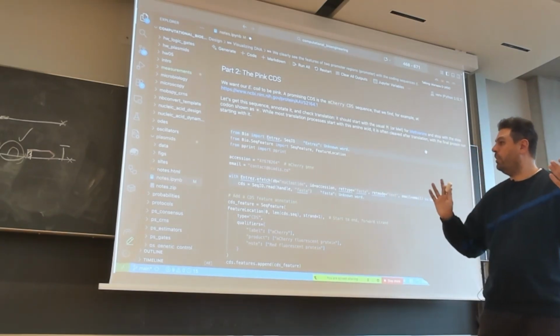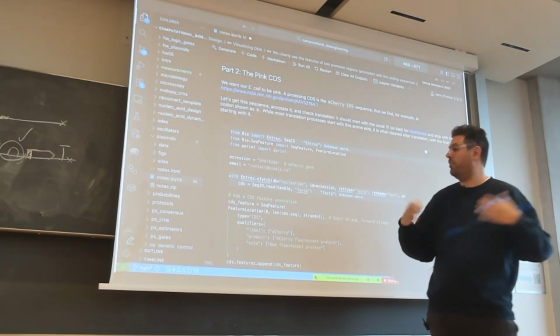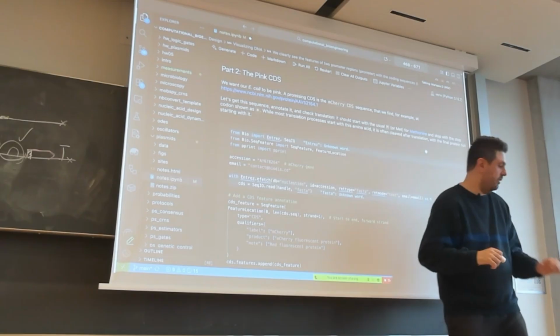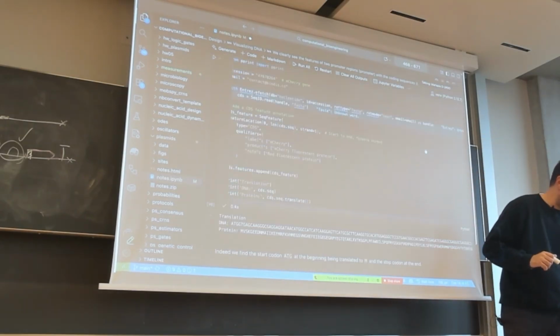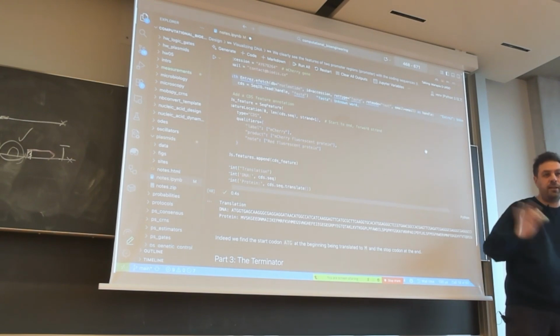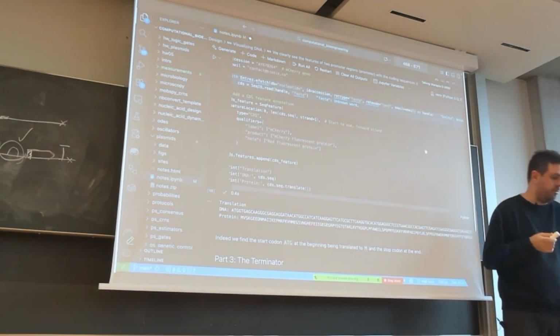Because yeah, what was very easy to find is I found very easily the protein sequence, but I wanted to have the coding sequence. But yeah, we found it, and here it is. We are downloading that, and we are also annotating that right away. Because whenever you bring something in immediately annotated, then you have that nicely in your viewer, right?